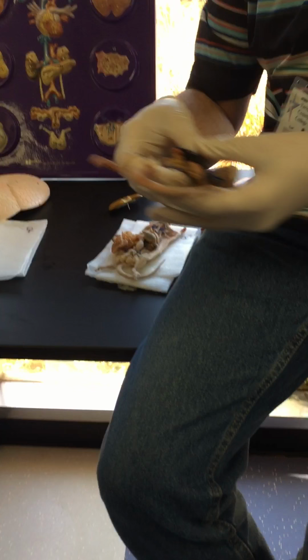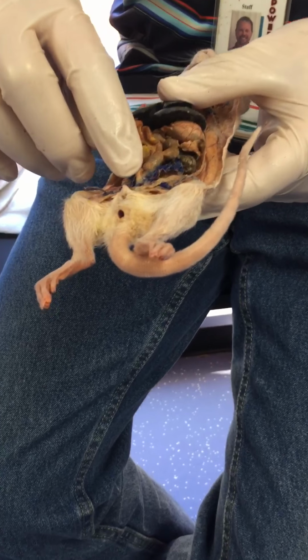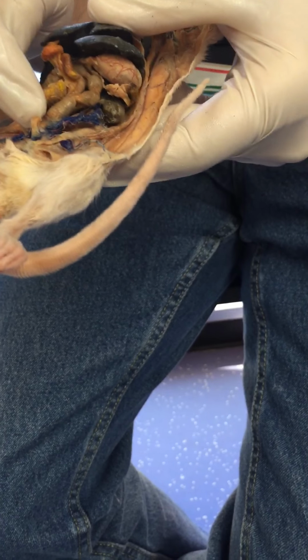Here, testes. Whereas here, the female doesn't have testes because she doesn't have the scrotal sac. If you see the fur wrapping around the testes there, that's the scrotal sac, and then you can see the penis there. Whereas in the female, notice a little bit of urinary bladder. They've got bladders that are tiny, and then right behind it.